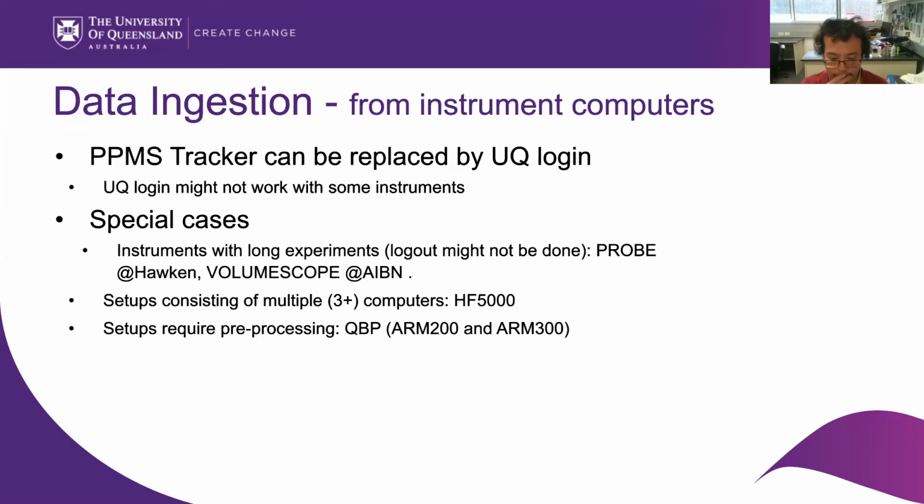And the second way of ingest works with most of the instruments in CMM, apart from three special cases. The first one is instruments with a very long booking, like a week-long to month-long booking. The second case is a setup that consists of multiple computers, in this case three. And the last special case is when the setup requires pre-processing. So in this case, the user needs to enter some numbers that act as a parameter to start off the pre-processing. So, three special cases. I will deal with them last in the rollout.